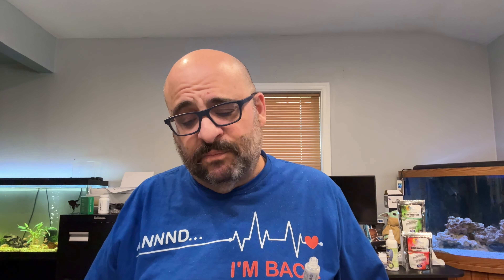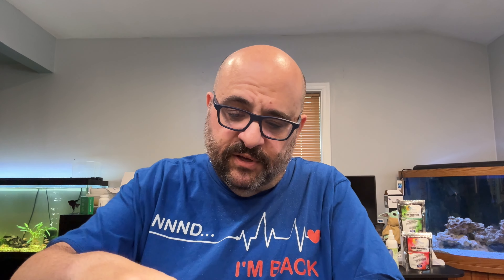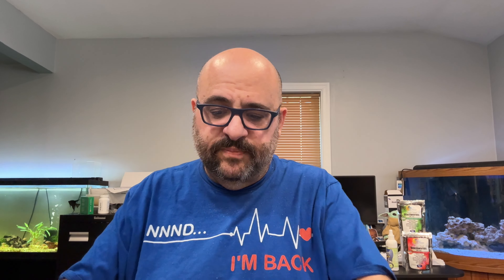The kit comes with the test tubes, all the bottles, and instructions. On the instructions are the color charts, and all of them have two different charts — one for fresh water, one for salt water. The ammonia instructions are pretty simple: fill a clean test tube with five milliliters of water, add eight drops of test solution one holding the bottle vertical, add eight drops of bottle two, cap the tube, shake for five seconds, and wait five minutes.